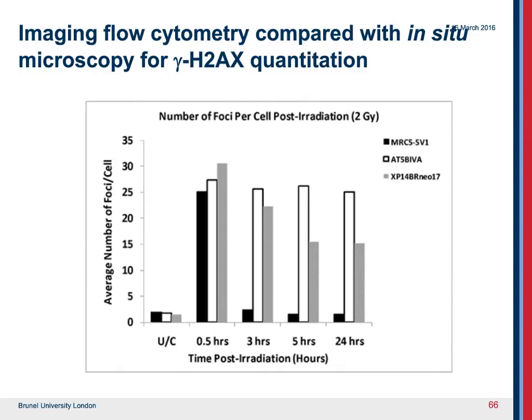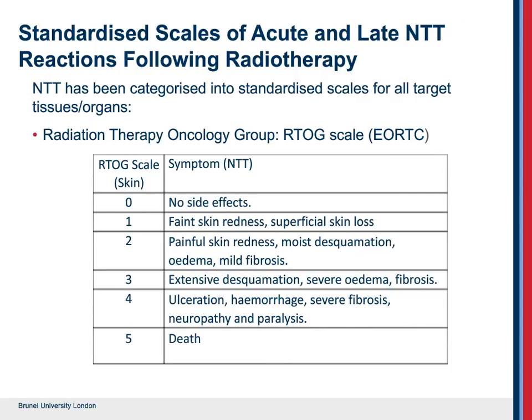But the really important thing for us is to take this information and, using the imaging flow cytometer from Amnis Millipore, to develop a diagnostic test. Now, in my group, we're really interested in why and how patients respond to chemotherapy and radiotherapy. And we're really interested in this from the viewpoint of side effects. Many patients suffer quite severe side effects, others not at all.